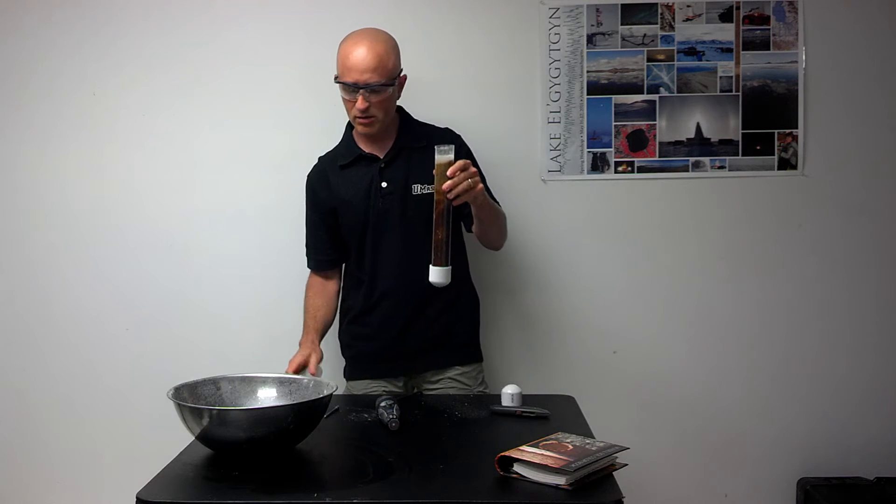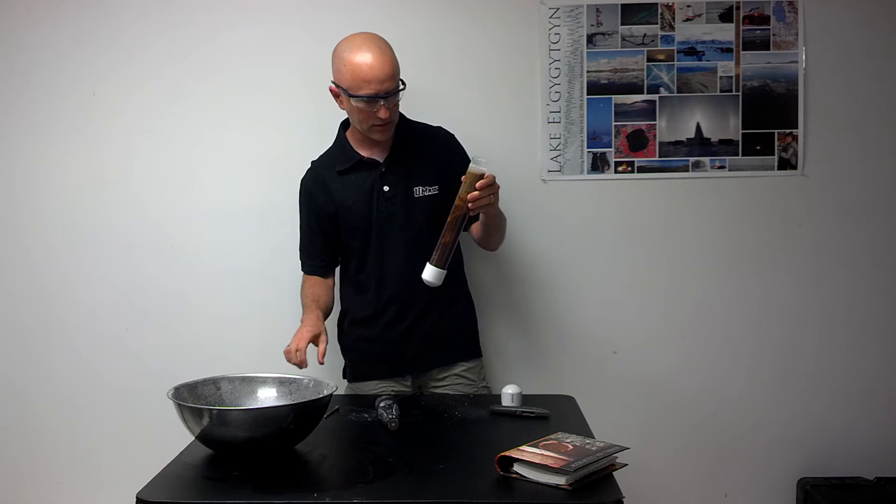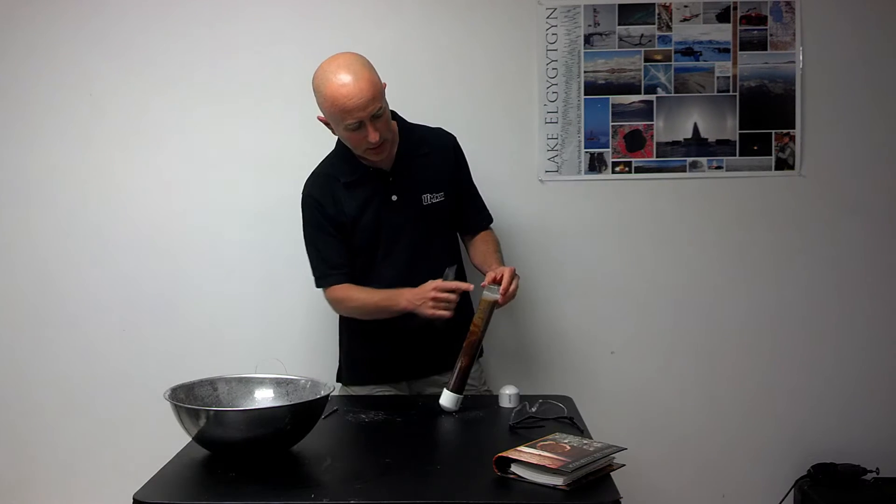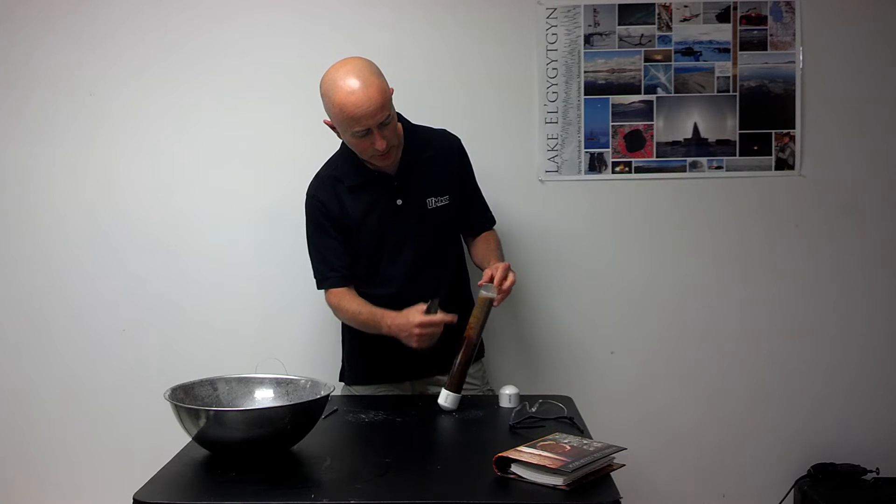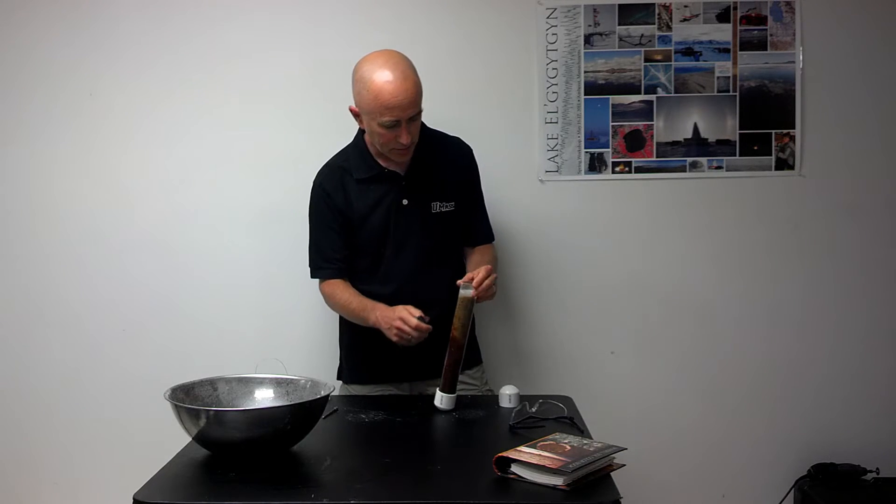With the excess plastic removed, we have a much more manageable length core segment. Next, we'll slice down through both sides of the plastic of the core liner.